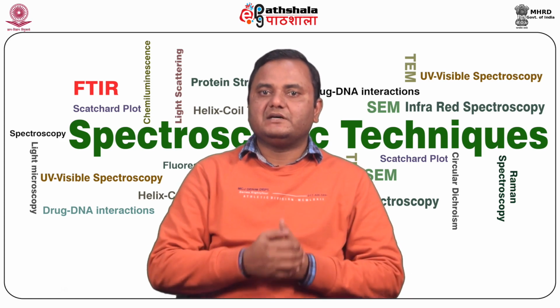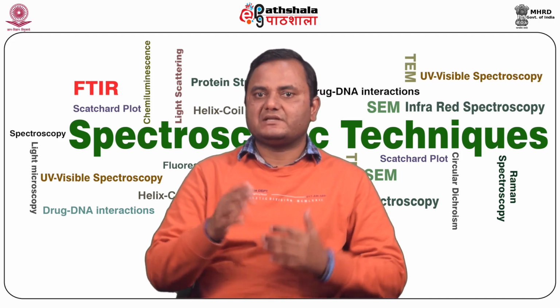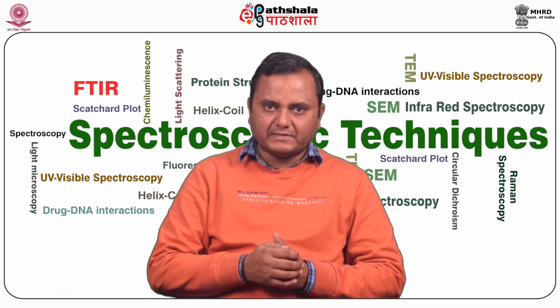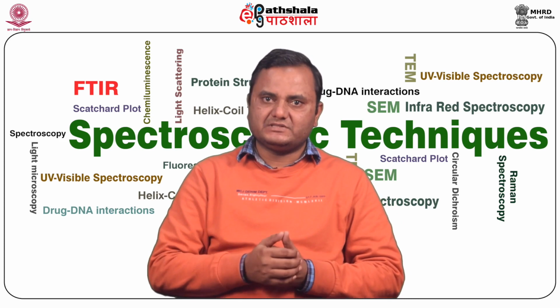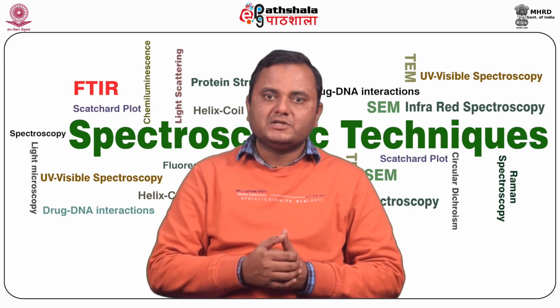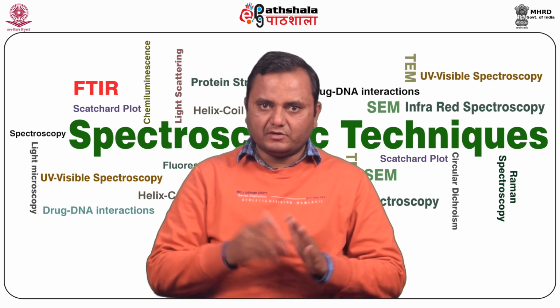Purge the instrument with nitrogen before using. Oxygen will be converted by the UV to aggressive ozone, which is why nitrogen purging is essential. After switching on, allow 30 minutes to warm up. Check the stability of the instrument by the drift of the baseline, and regularly calibrate the equipment using a calibrating agent. The lifetime of the light source is approximately 1000 hours, so don't keep the instrument on all the time. Start the light only when you need it.